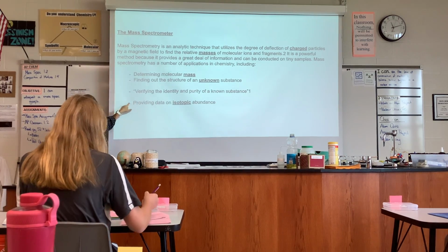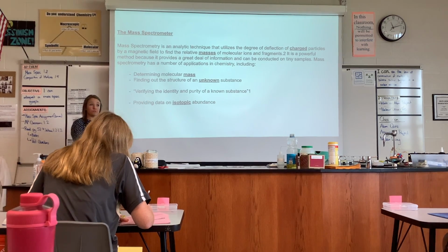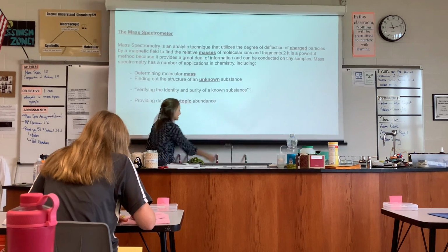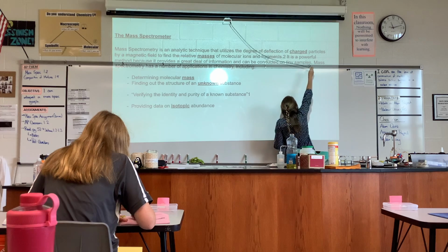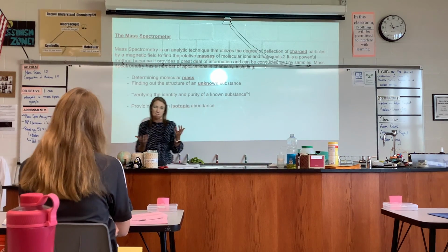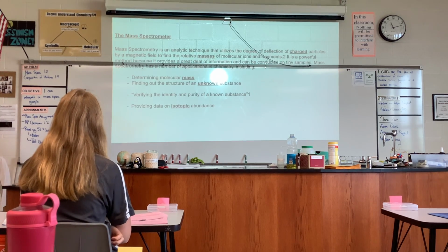So if you're going to put a star by this last one, this is what you are going to be doing in this class. But once again, if you go on and continue to study chemistry, then you'll get to learn how to do the other ones, which are really cool. Okay, so we're just going to go through once again the breakdown of how a mass spec works. And then we'll get to the graph and analyzing side of that.